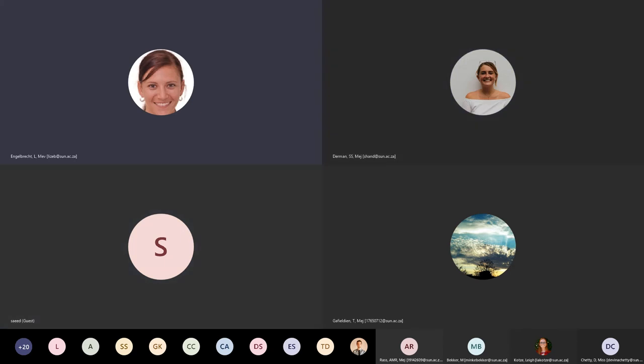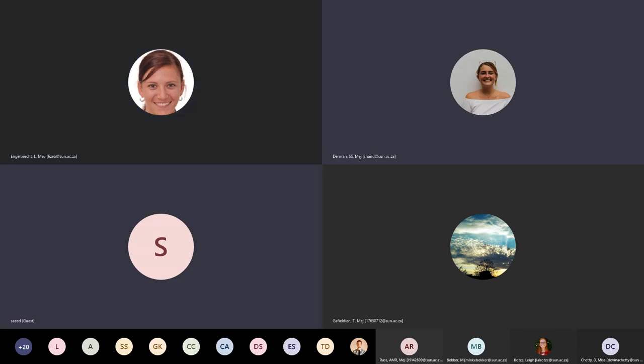Tell me quickly, are you using Zen Blue or Zen Black? Zen Blue. Okay. I don't know, so this is something that I would have to look at with you. My images usually export properly, but are you exporting in ImageJ or are you exporting in Zen? Or are you exporting from Zen to put into ImageJ? I'm doing all my edits on Zen and then saving it as a JPEG to take over.